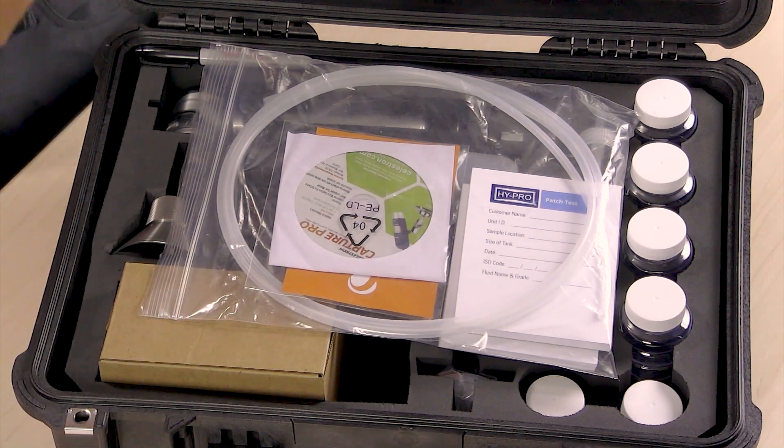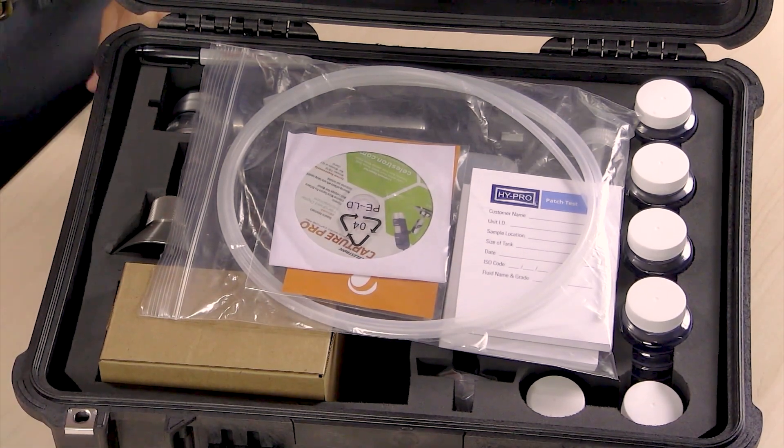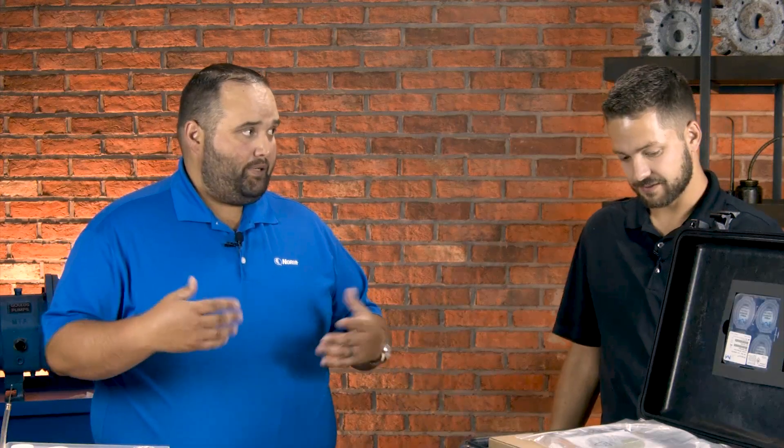Most people do oil analysis in a laboratory, sending samples off every month or so. That way you can look at particles, contaminants, wear debris. The patch test is really a test that punches above its weight — you can tell a lot about what's going on. If you're seeing wear debris in your regular analysis or noticing the machine's not running right, this is a test for a quick turnaround. You can't wait several days for that data. Looking at a microscope, this allows you to check exactly what you're looking at — it's a quick turnaround.